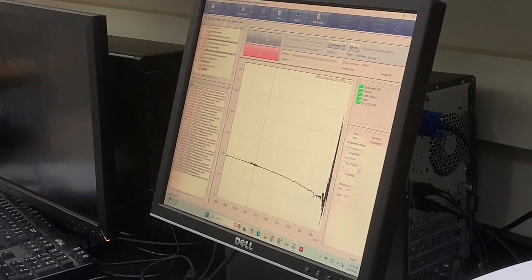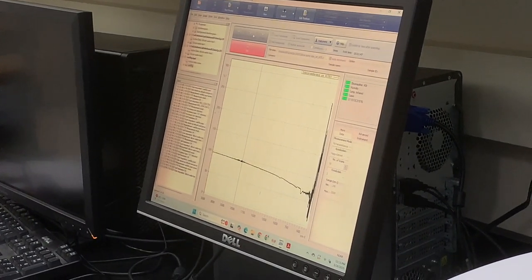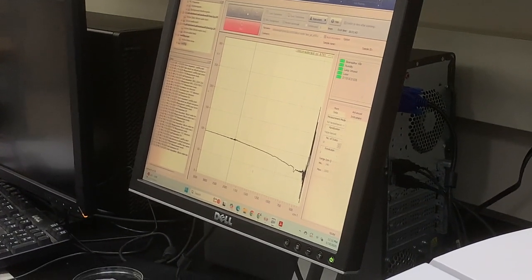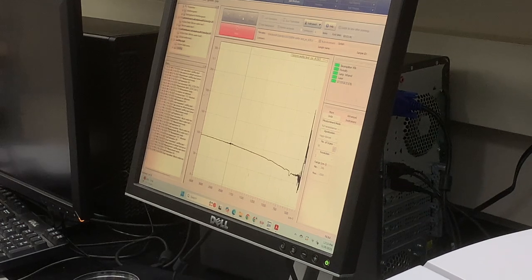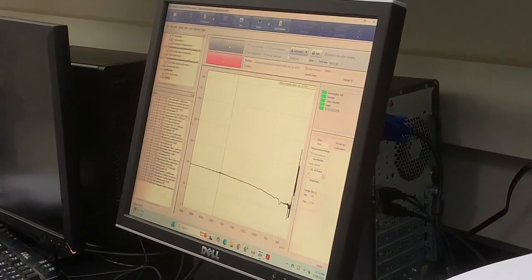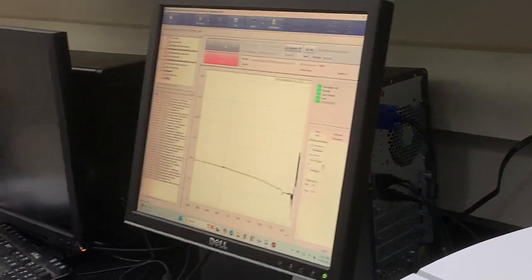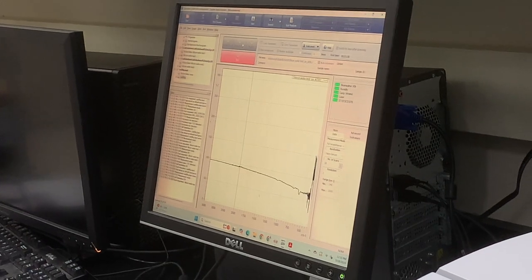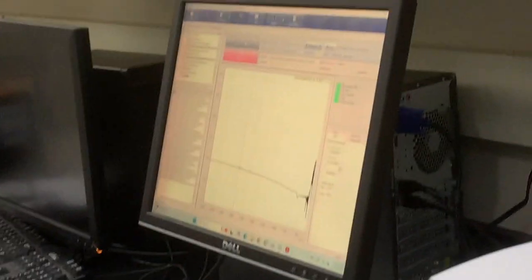Are you going to have different thicknesses? Yes, that's why I was thinking the silicon wafer should be kind of transparent for infrared emissions, because most people actually report a very good profile for the vanadium dioxide coated on silicon wafer under the FTIR. So if the sample is opaque, they will not be able to report these vanadium profiles. Many people do that. That's why I'm asking about it.